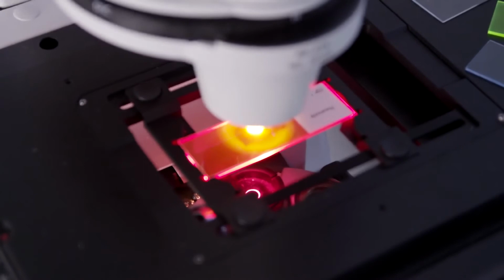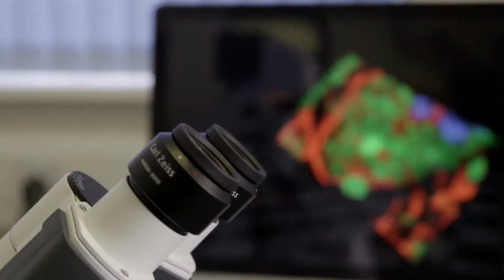We modify the illumination of the microscope so that we project a pattern of lines onto the specimen. It's then a matter of clever optics and computer processing to remove the parts of the specimen where there are no lines. It's then a matter of removing the lines from this thin section near the optical focal plane, and that will reveal a thin, in-focus optical section of the thick specimen. We then physically focus through the whole thickness of the specimen, recording these thin sections at each plane, and then we replay in the computer to have a wonderful three-dimensional representation of the whole object.